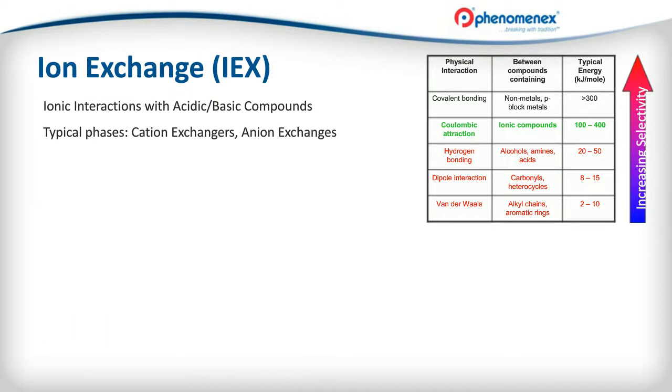Spoiled the surprise, in that we're again showing you that there is an increased amount of energy required to break these types of bonds for the Coulombic attraction in green. Again, substantially more than the dipole-dipole interaction and hydrogen bonding that takes place with other forms.